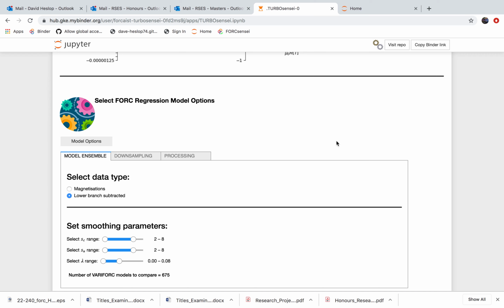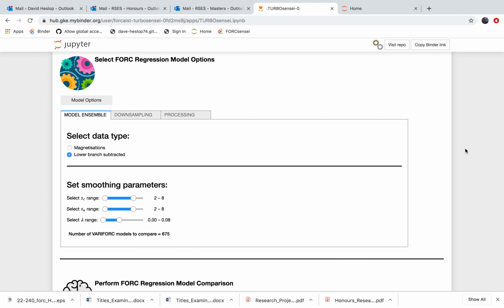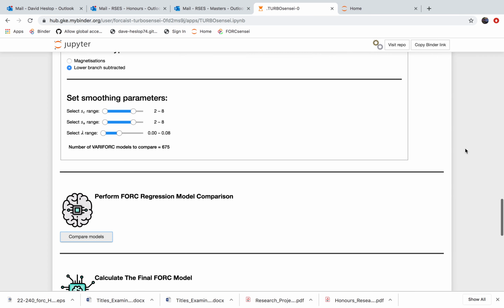Basically, all the code is on GitHub, and this cloud service is called a Binder service. This is a free version, but there are other pay-for options as well. What they do is, if you have a Jupyter notebook in your GitHub repository, and you include a few configuration files that say things like what packages you depend on, it will automatically build this instance of the notebook on the cloud for you and do all the calculations.